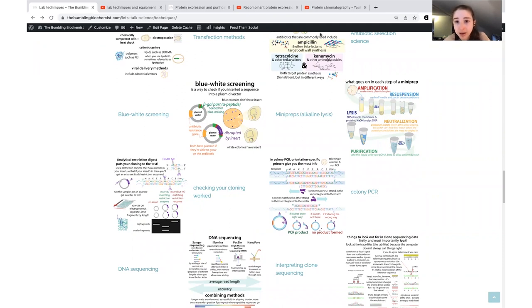When you do the cloning, you plate it out on an agar petri dish with antibiotic. Bacteria that are able to survive are going to land in one spot and then start growing. When they're multiplying, they're doubling and doubling and doubling on top of themselves, making this gloopy dot. Each of these gloopy dots is called a colony and it should be genetically identical.